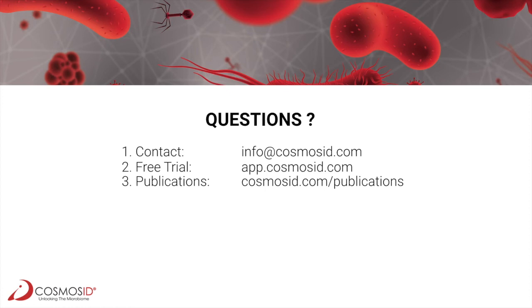That's a good question. And as you know, in the sampling of skin specimen, swabbing and tape stripping are two methods to obtain the skin microbiota of the skin. And tape stripping is a more invasive approach that is to some extent harmful compared to swabbing. There are several studies that we're aware of that are forthcoming that suggest that there is no statistically significant difference between the two approaches, but we're obviously monitoring progress in that area closely, and we're experienced with both technologies. Next question.